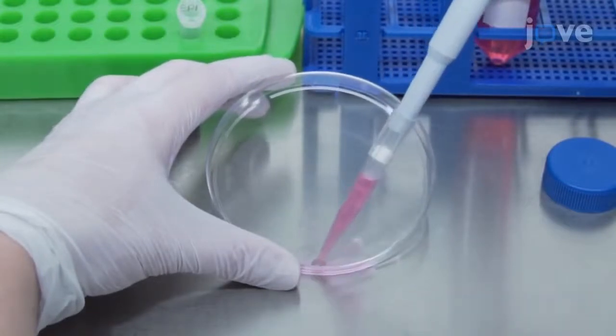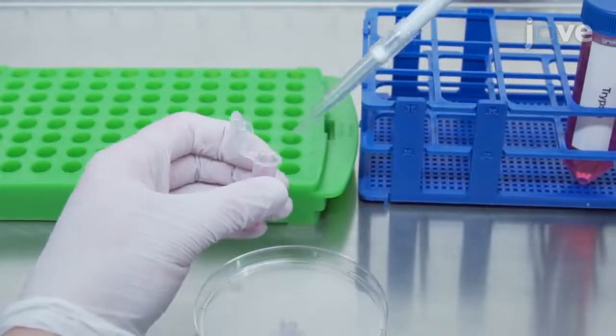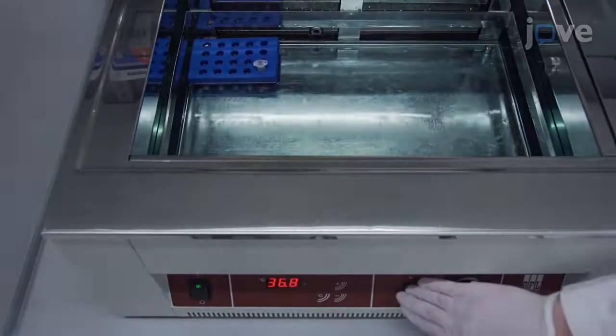Using a P1000 pipette tip, transfer them into a 1.5-milliliter conical centrifuge tube. Then incubate the tube for 10 minutes at 37 degrees Celsius inside a water bath with constant shaking.